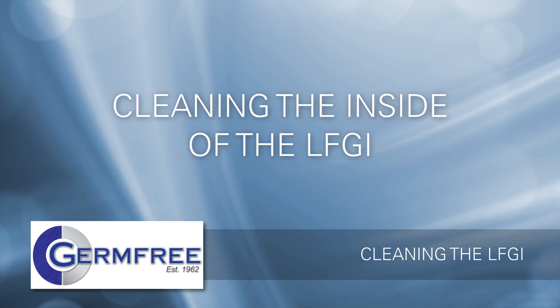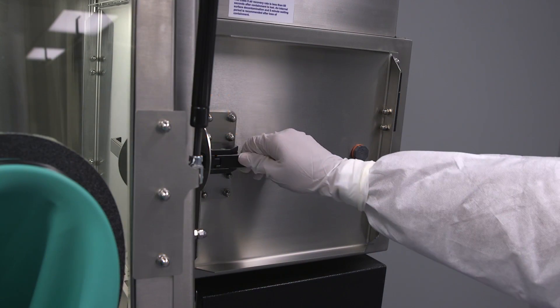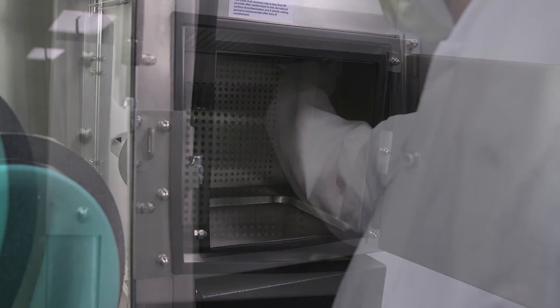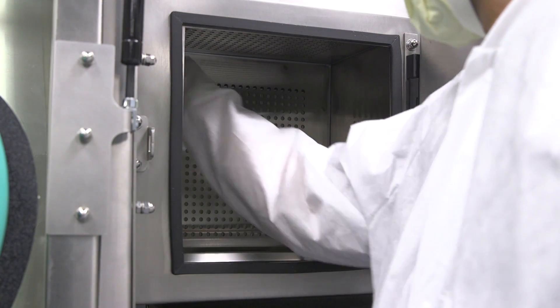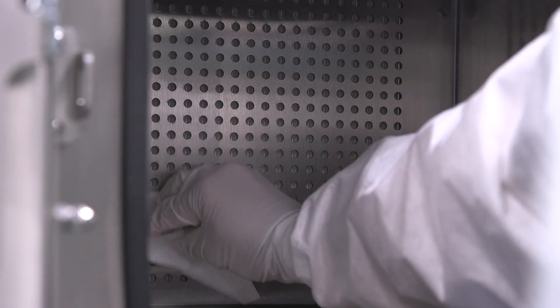Once the outside of the unit has been cleaned, you're ready to begin cleaning the inside of your LFGI. To clean the airlock, complete the following steps. Clean the top HEPA filter protector with a disinfectant wipe. Wipe the back HEPA filter protector, then both sides of the airlock. Clean the inside of the outer airlock door.